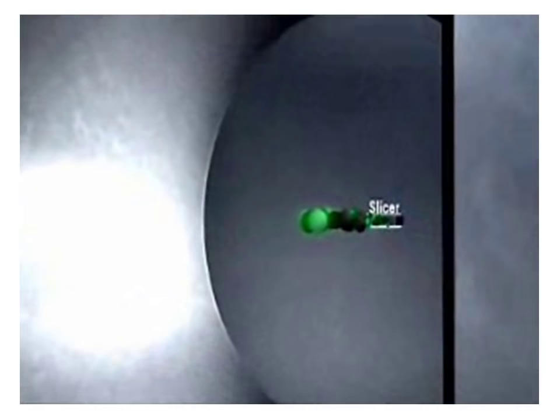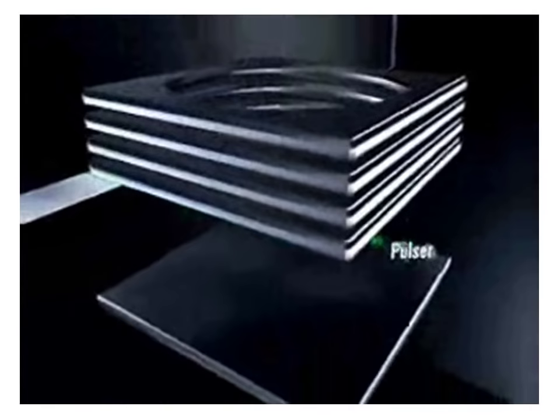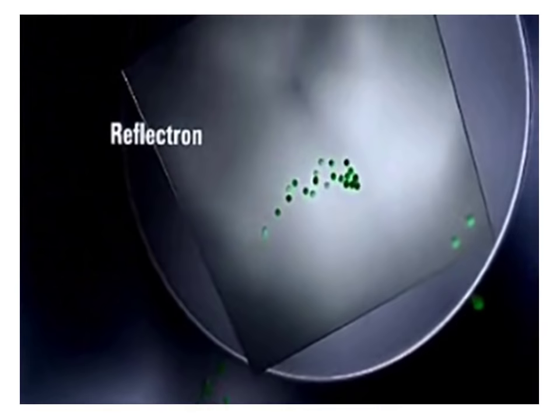The fragment ions are compressed into a nice flat packet before they reach the TOF tube, so that all of the ions have the same starting time before they are pulsed into the TOF. As you can see them rising straight up, they all have the same start time, and ions of the same mass stay together, but ions of different mass have a different flight time. They get reflected back from the reflectron and down to the detector.